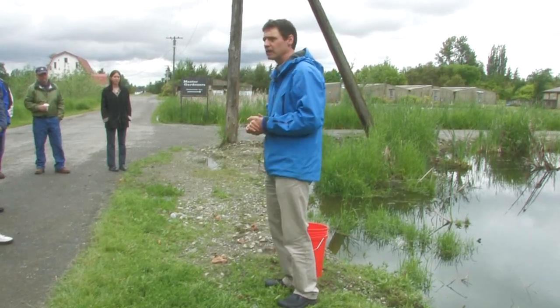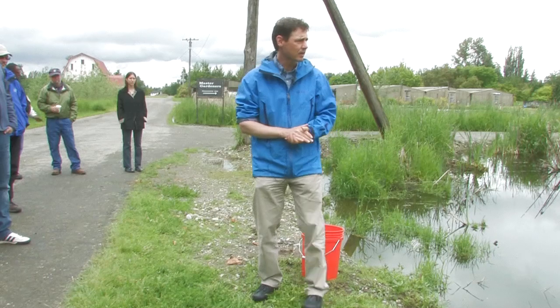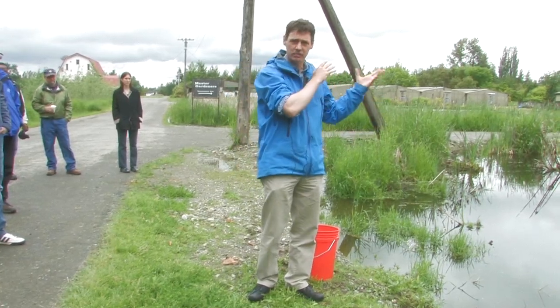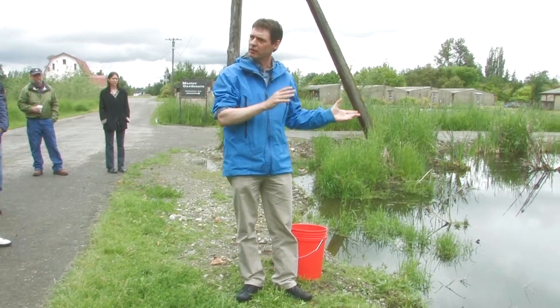Rule number two is getting a representative sample. We want to think about how am I going to collect this sample in such a way that I'm actually going to be measuring what's in this water, not some oddball outlier value that doesn't represent what I'm measuring.